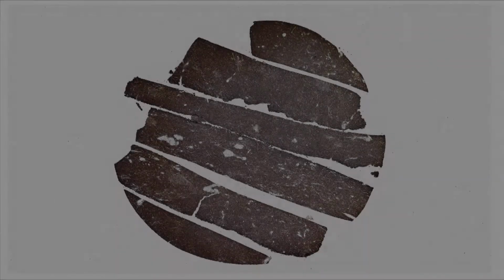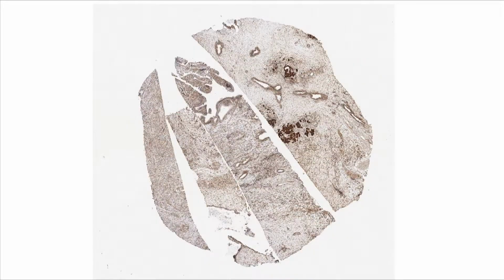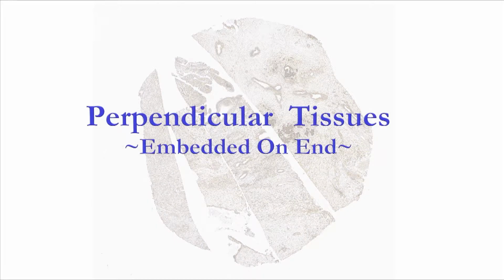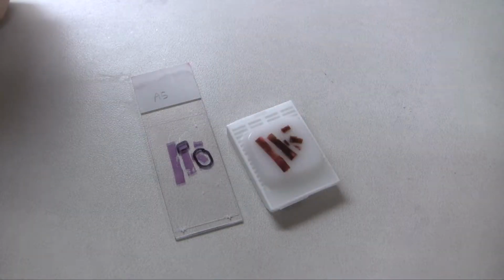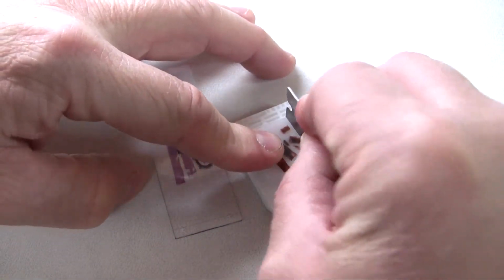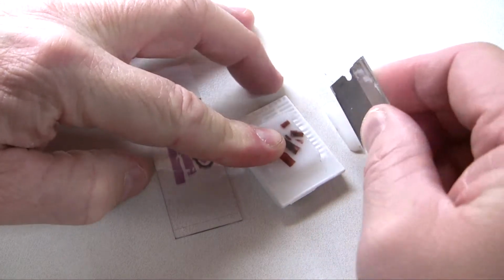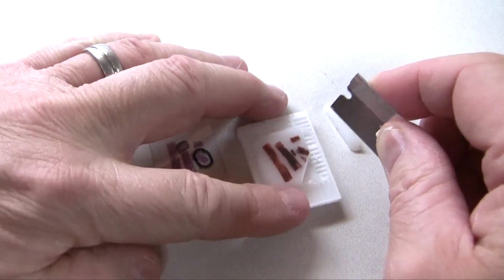If you have tissues that have been almost depleted, or in other words, thin or very shallow, your next options would be to either scrape it out of the block and make a sausage, as I have just explained, or re-embed it perpendicular or on end. To embed the tissue on end, you will need to remove it from the block. You can either cut the selected sample out of the block or melt it down to retrieve it.